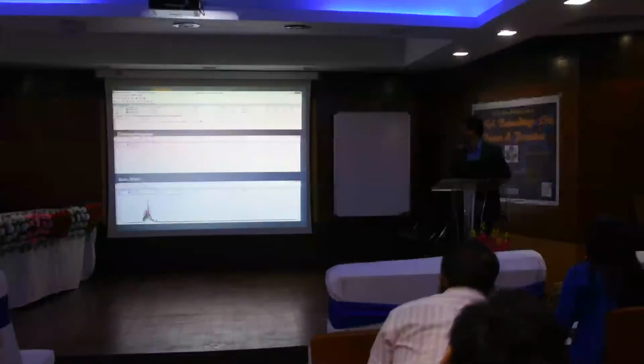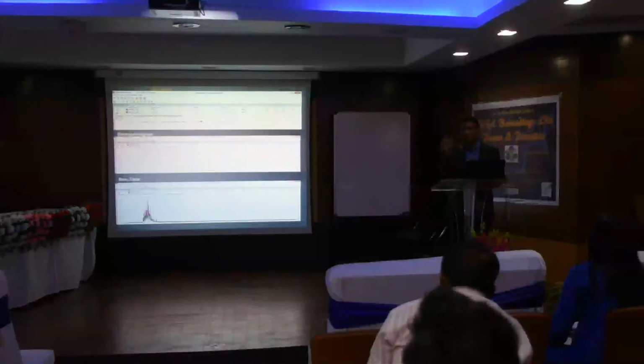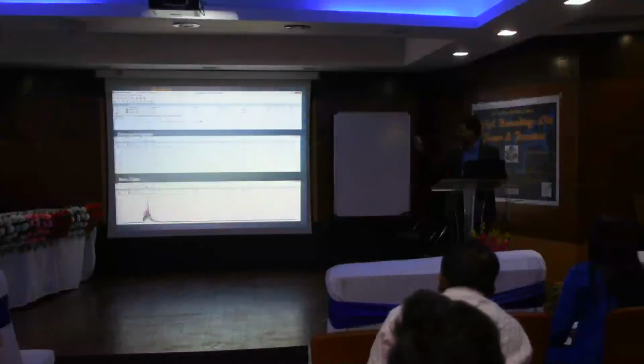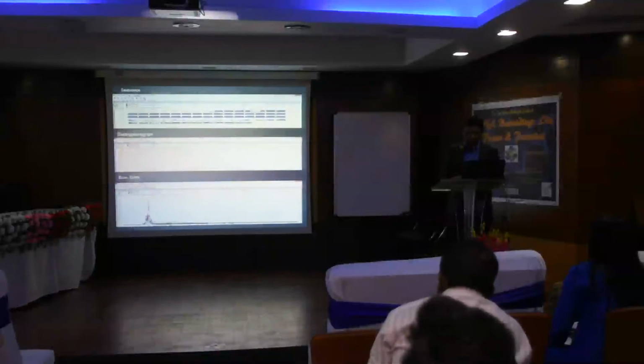Sometimes you will get something like this. This is nothing, this is very poor. Your template had non-specific amplification, so a small template is there, and it was able to read up to that and finish. In some cases you don't get anything, in some cases you will get this. This is typically a very high salt concentration present in your sample, and where is that coming from? The DNA isolation. So that cannot be eliminated.